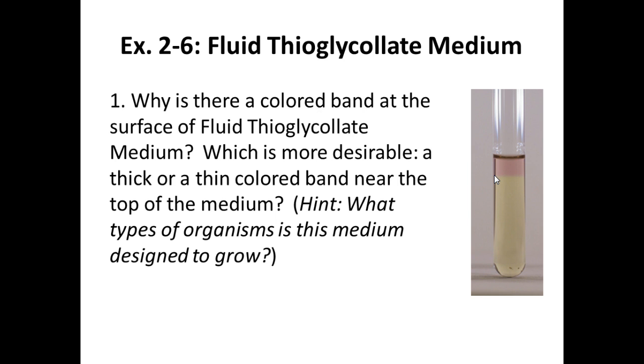So any of our organisms that need oxygen have this space to grow. If you have a lot of oxygen in this tube, then you don't have any space for your anaerobes to grow. And that's the main reason why we're using this media. You'll notice our question for our unknown report is, can your organism grow anaerobically, right? We want to know, can it grow without oxygen at the bottom of this tube?